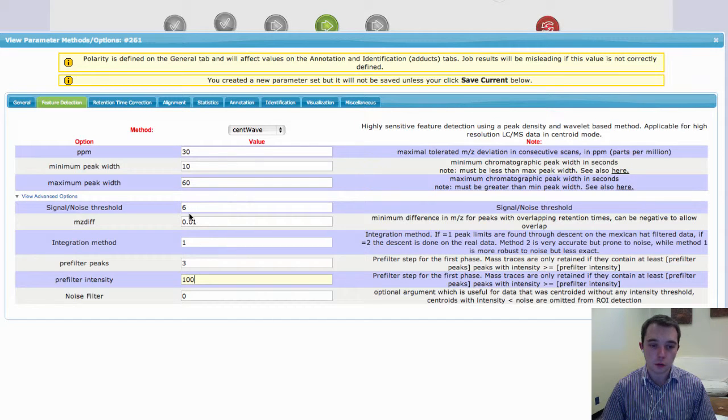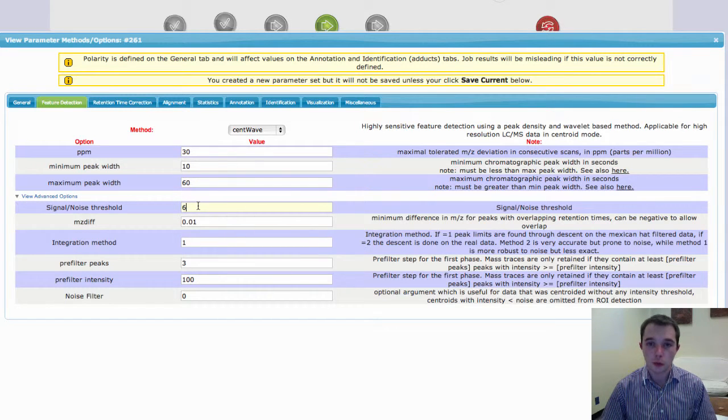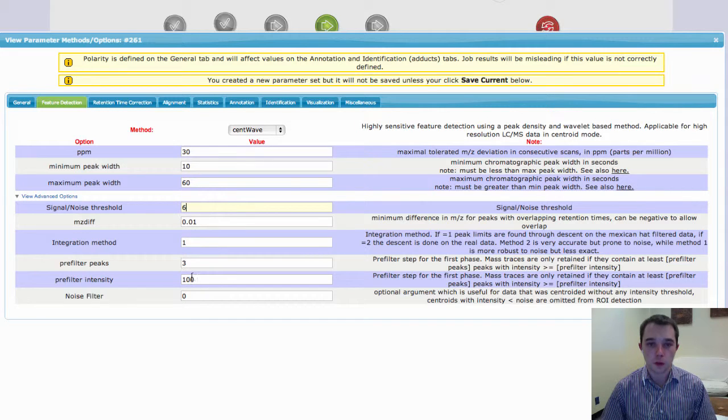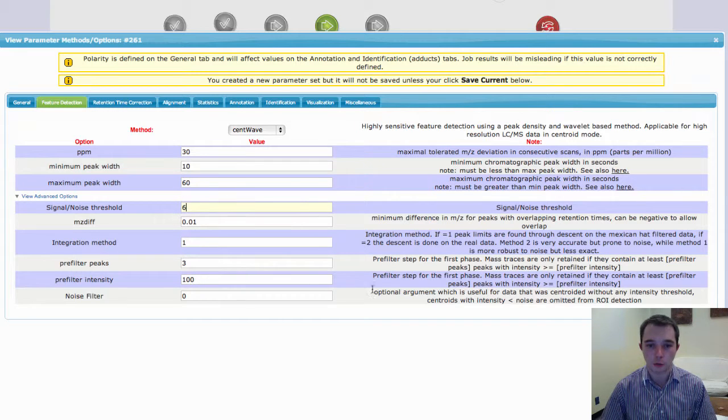There is the regular signal-to-noise ratio that you can set as well, but this does, in my experience, a very nice job of that.